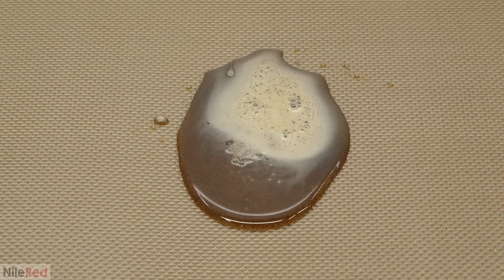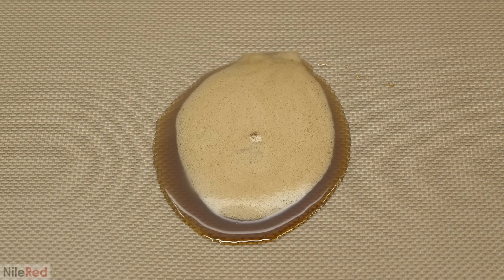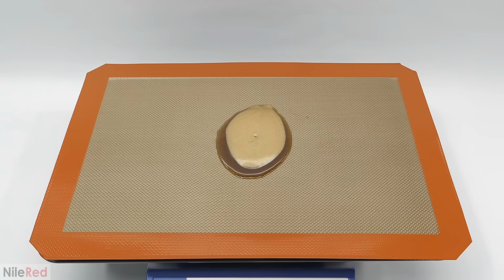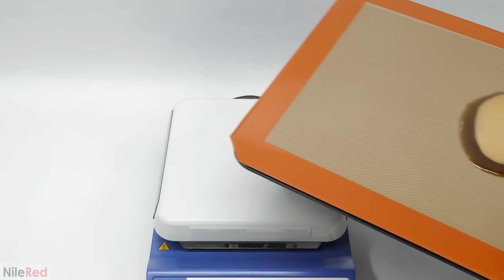My only issue here was that I had no idea how long I had to heat it for, and I was also really afraid of burning it. I ended up letting it go until I felt that it looked good, which took about an hour. I then pulled it off the hot plate, and I waited for it to cool down to room temperature.